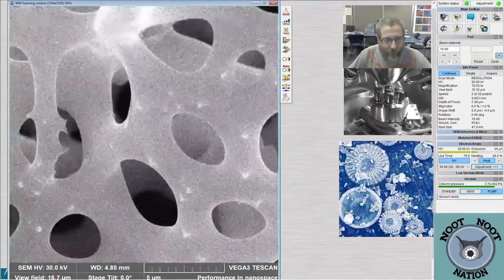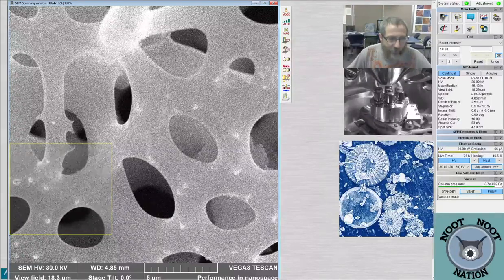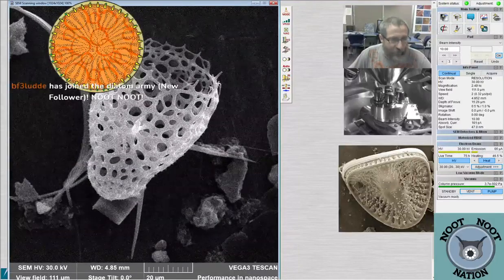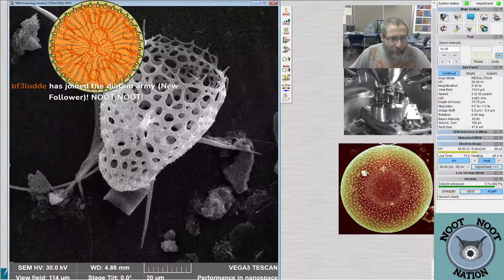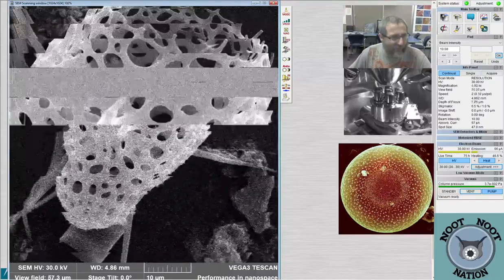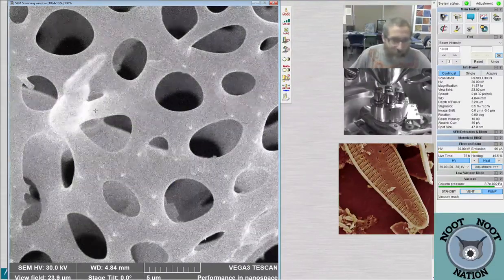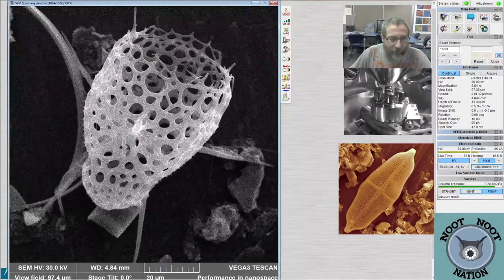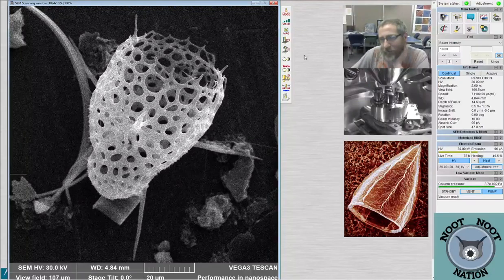Ooh, Jan wants to know, what's the oldest sample of diatoms ever recorded? Because I don't work in the marine realm regularly, I don't know the answer to that question perfectly. I know that they found some stuff. Part of the problem, Jan, is that some of the things that people think might be a diatom, it's not clear whether it's actually a diatom. So it's sort of fuzzy. It's on the edge of what we would consider to be a diatom for sure. And so that's like early Jurassic, I think. Sort of time frame. But I think there's some stuff that's definitely late Jurassic that's unquestionably a diatom. So I usually just tell people Jurassic when they ask me that question, just to get roughly in the right neighborhood.